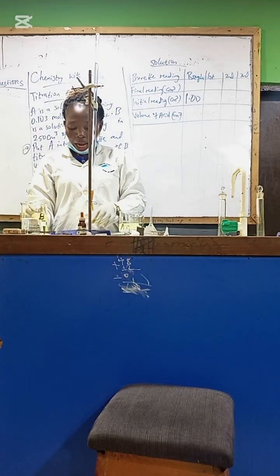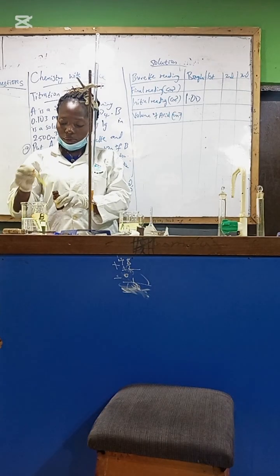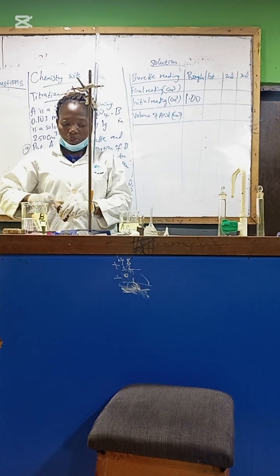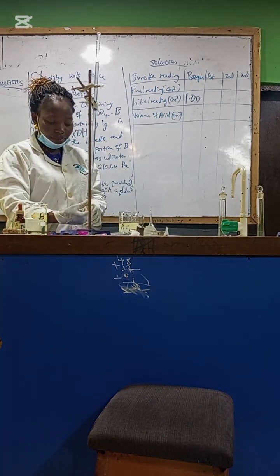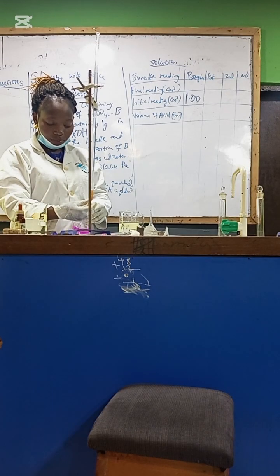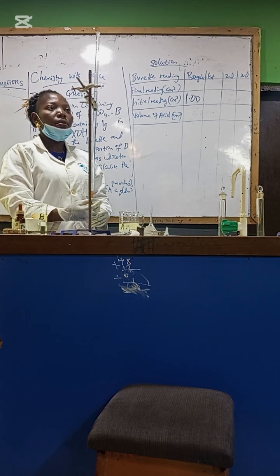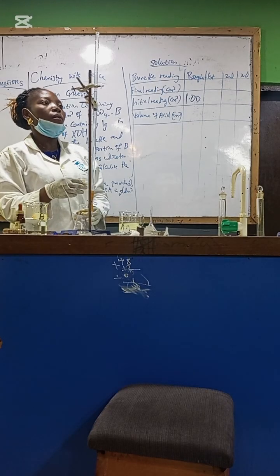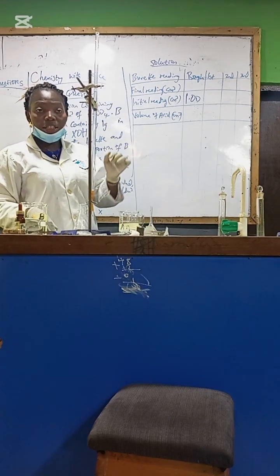So you can see, now I will add 1 drop of phenolphthalein here. Just 1 drop. You can see the color is pink. Then let's start. Our color changed at 12.30.